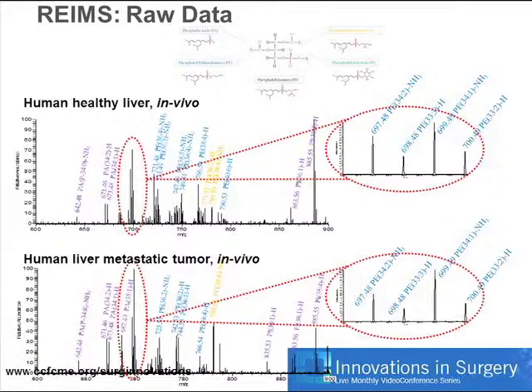Quite often what we're measuring really is glycerophospholipids, so phosphatidyl serines, phosphatidyl glycerols, and we predominantly use a specific mass charge region. We predominantly use about 600 to 1,000 range of the spectra to make our analyses. We don't necessarily see expression of different species of molecules, but we will see semi-quantitative changes in those species, which we use to build our models.